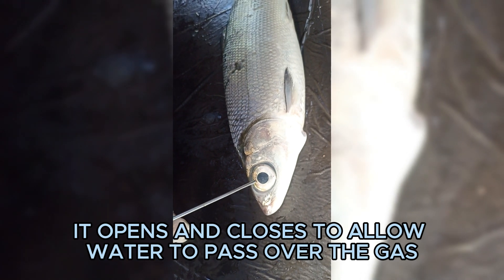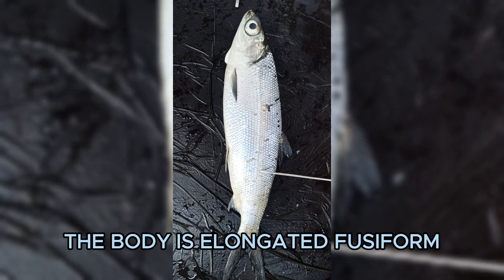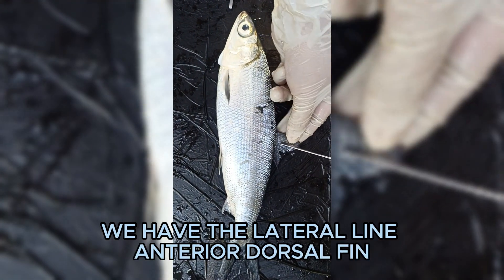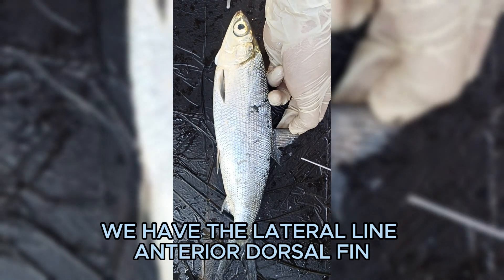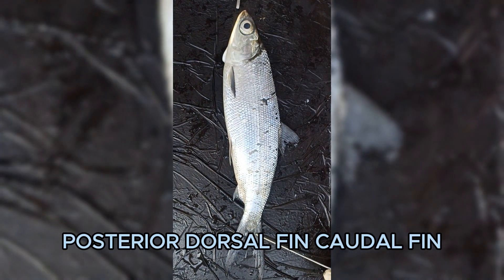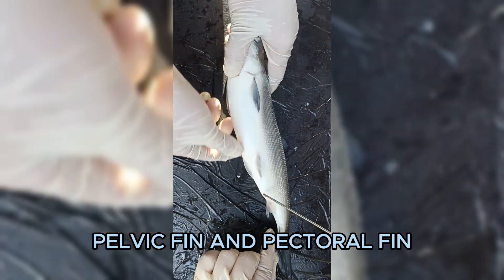The body is elongated, fusiform, compressed, and symmetrical. For the external parts of the body, we have the lateral line, anterior dorsal fin, posterior dorsal fin, caudal fin, anal fin, anus, pelvic fin, and pectoral fin.